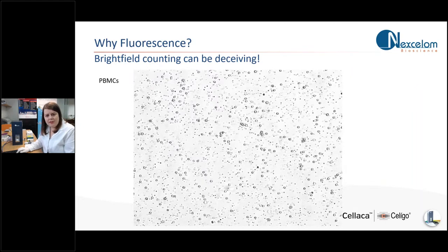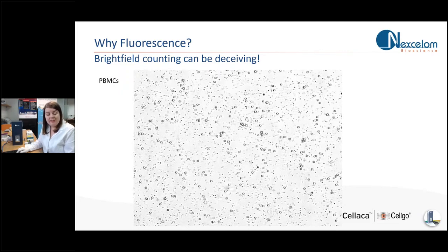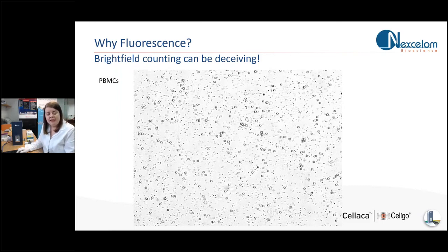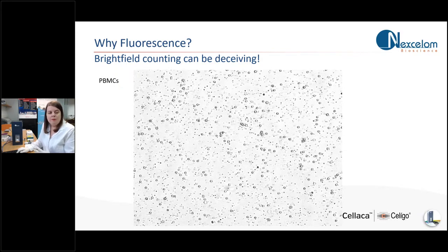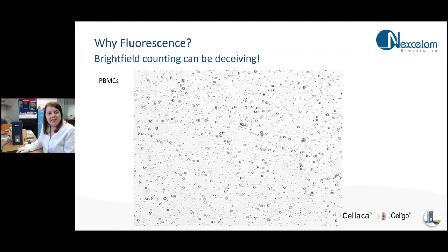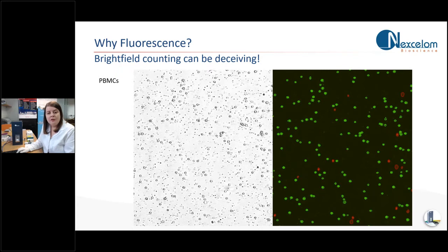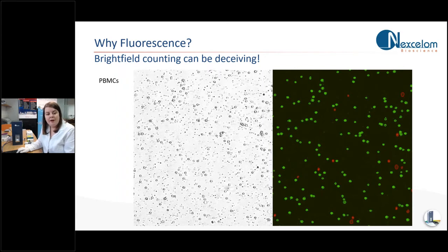So why should we use fluorescence instead of trypan blue for viability? Well, brightfield can be pretty deceiving, especially with samples such as PBMCs and other primary samples. This is a separated PBMC sample here. And from the brightfield image, I hope you can see it contains many different cell types of different sizes and a lot of background within that image as well. It would be pretty difficult to count by eye or count using this brightfield image alone to see how many PBMCs were in that sample. You will always get some sort of red blood cell contamination, even if it's very low and your separation processes are good. There will always be some red blood cells within those.